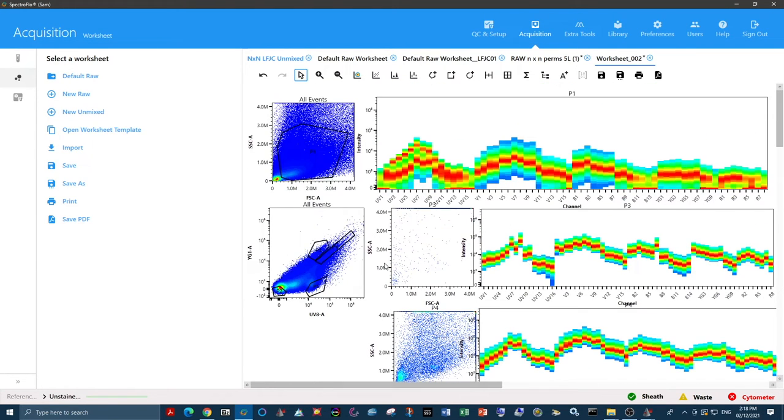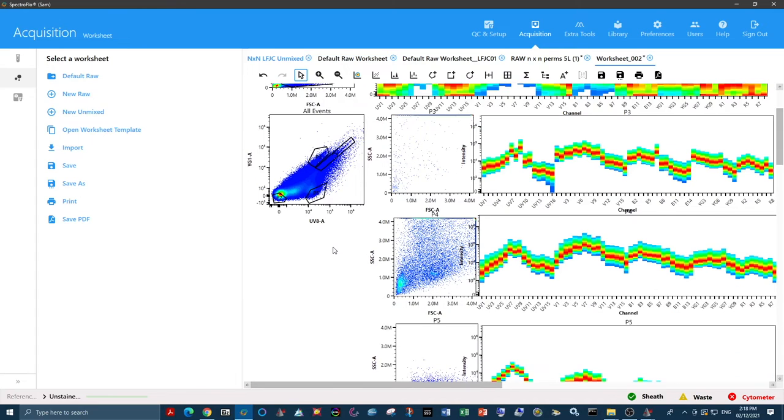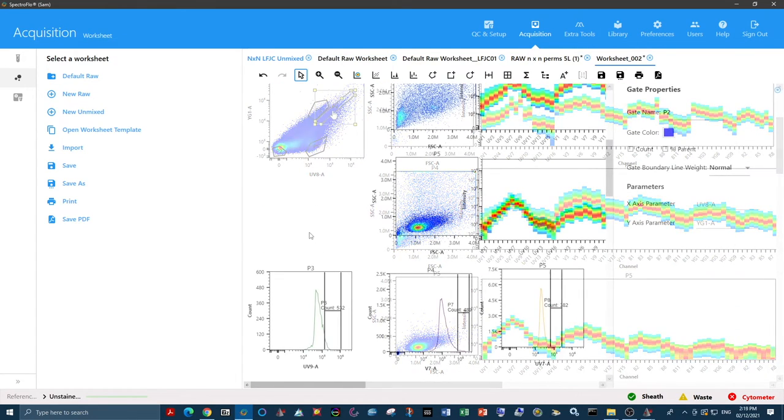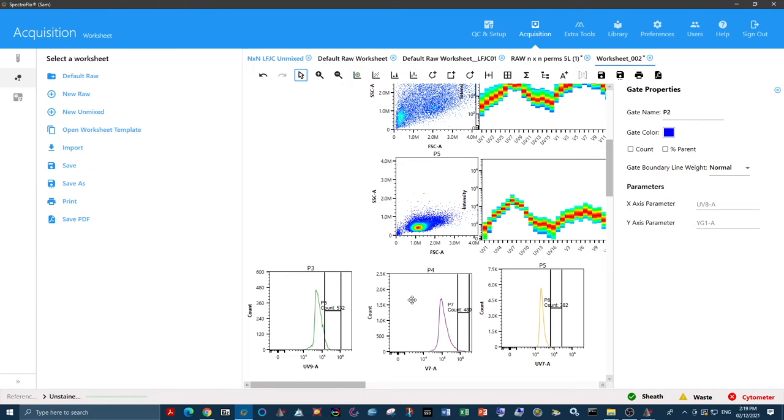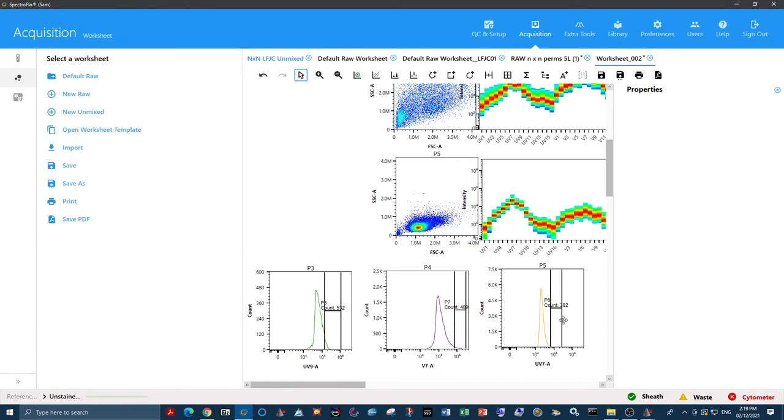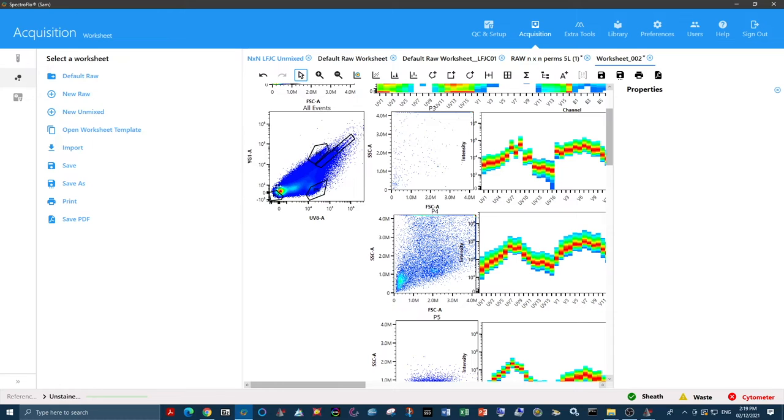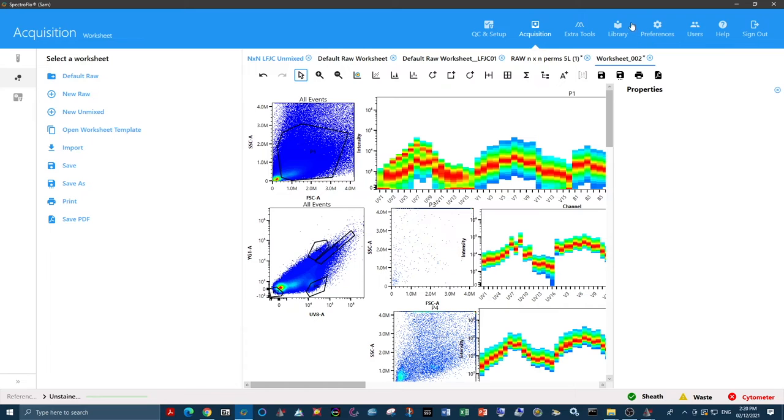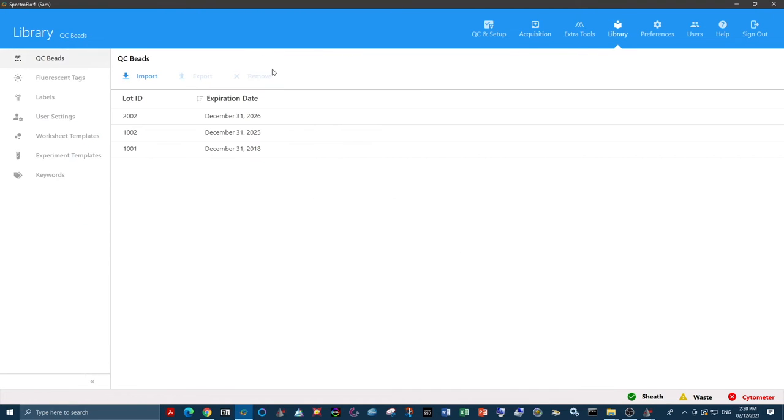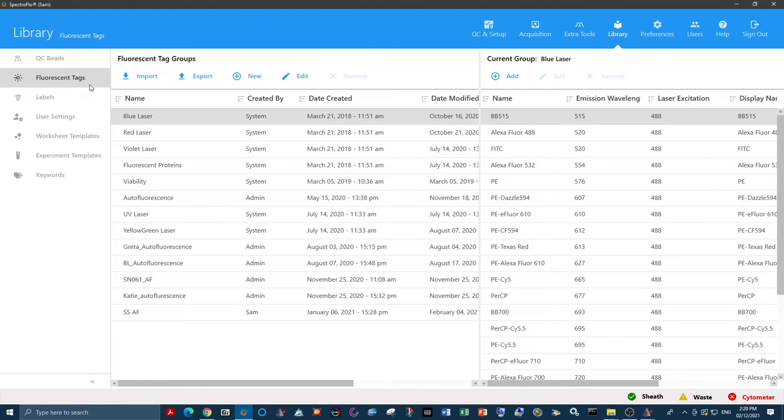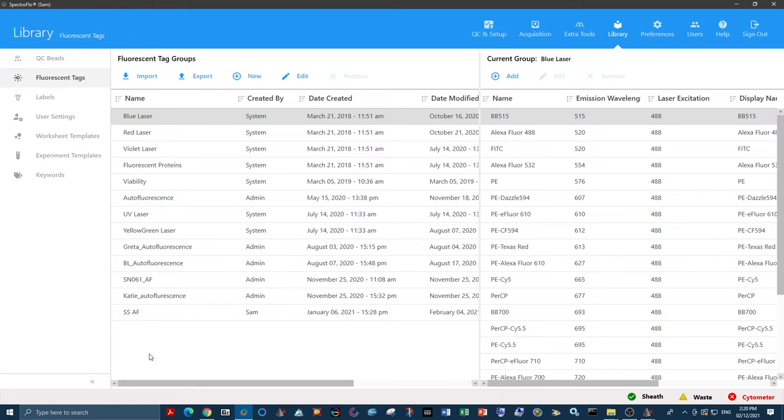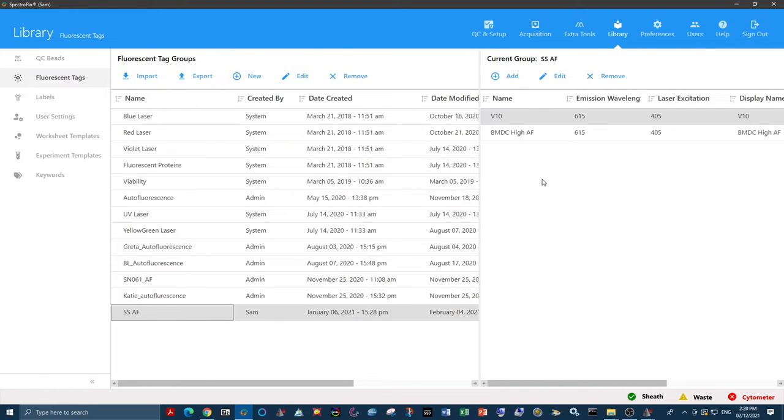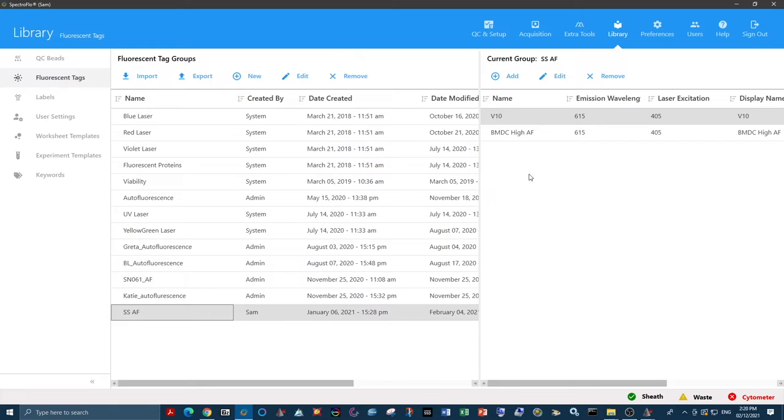Now we repeat that for our two other populations, as well as our autofluorescent dim population. Once you have exported all your heterogeneous autofluorescent populations, as well as your dim autofluorescent negative, then we need to designate these as autofluorescent tags in the software. All fluorescent tags that are in the SpectraFlow software are found in the library portion. When adding autofluorescent tags, we recommend adding a new group so that you always know which ones are autofluorescent and which ones are not.